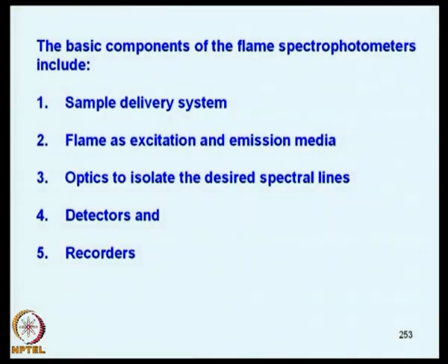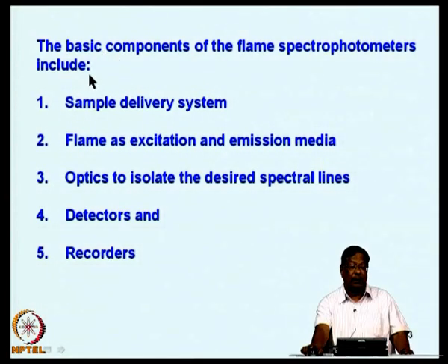In this slide I would like you to compare the common instrumentation. For example, the sample delivery system is almost similar in flame atomic emission as well as in atomic absorption. The flame also serves as the excitation and emission medium, and optics you need to isolate the desired spectral lines. These are also readily available in atomic absorption, and you need to use the detectors and recorders, etc.